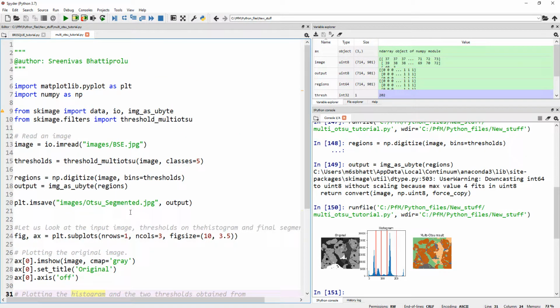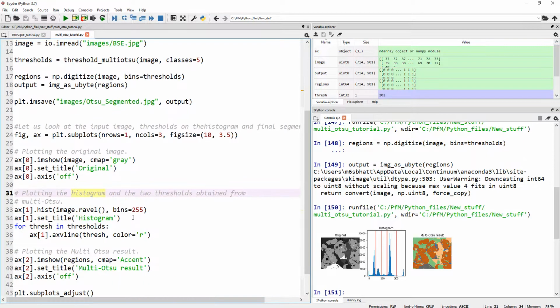If not, of course, resort to other types of segmentation, which is traditional machine learning, which I already covered in one of my previous tutorials, or deep learning, which I also covered as part of one of the previous tutorials. I hope you found this tutorial to be useful and educational.